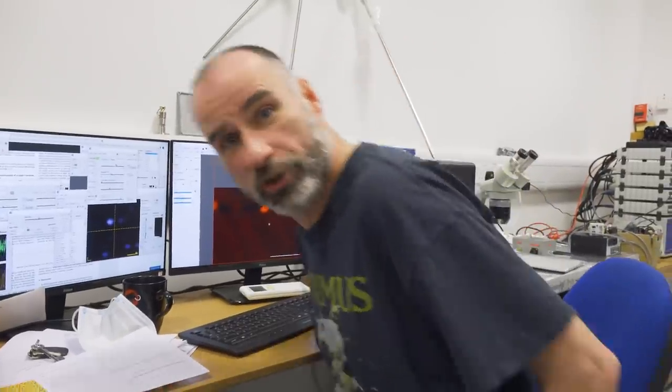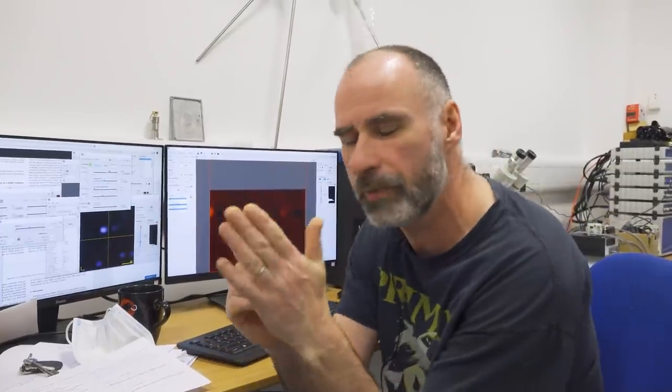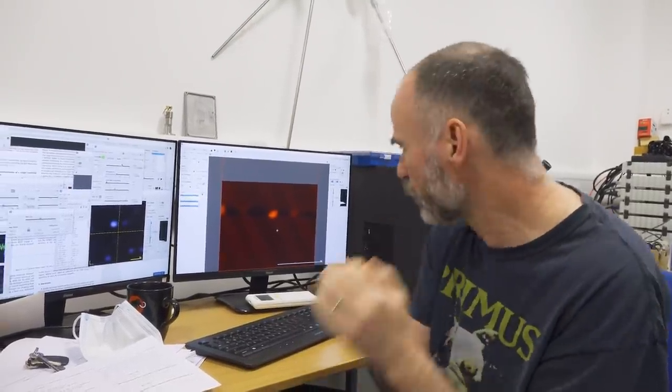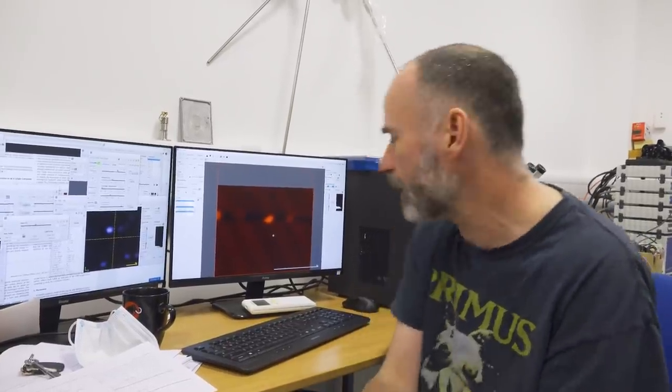Interesting question is, what color is an atom? So the important thing to realize is that a scanning probe microscope is a microscope like no other. We have that tip, and our image is based on the current that's flowing between the tip and the sample. And it's a quantum mechanical tunneling current. This is quantum mechanics in action you're seeing here, but the microscope itself has no optics, no lenses, no mirrors. It's not imaging in the sense that a traditional microscope images. Our image is based on the amount of current we measure at different parts in the image. That's basically what it is.